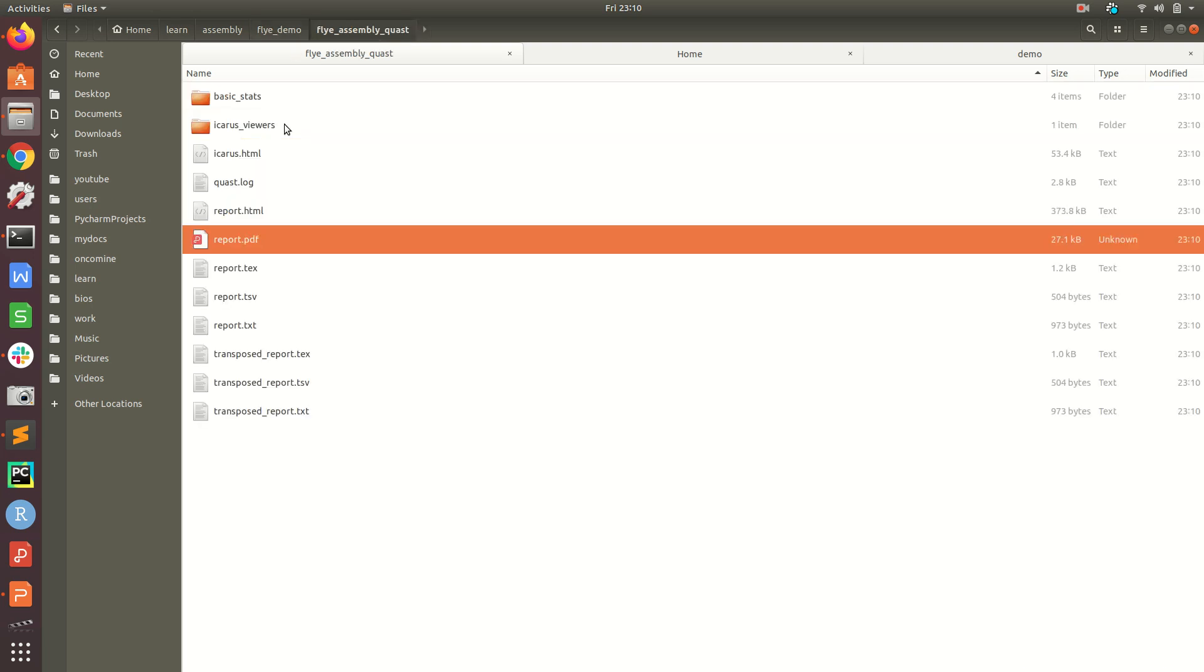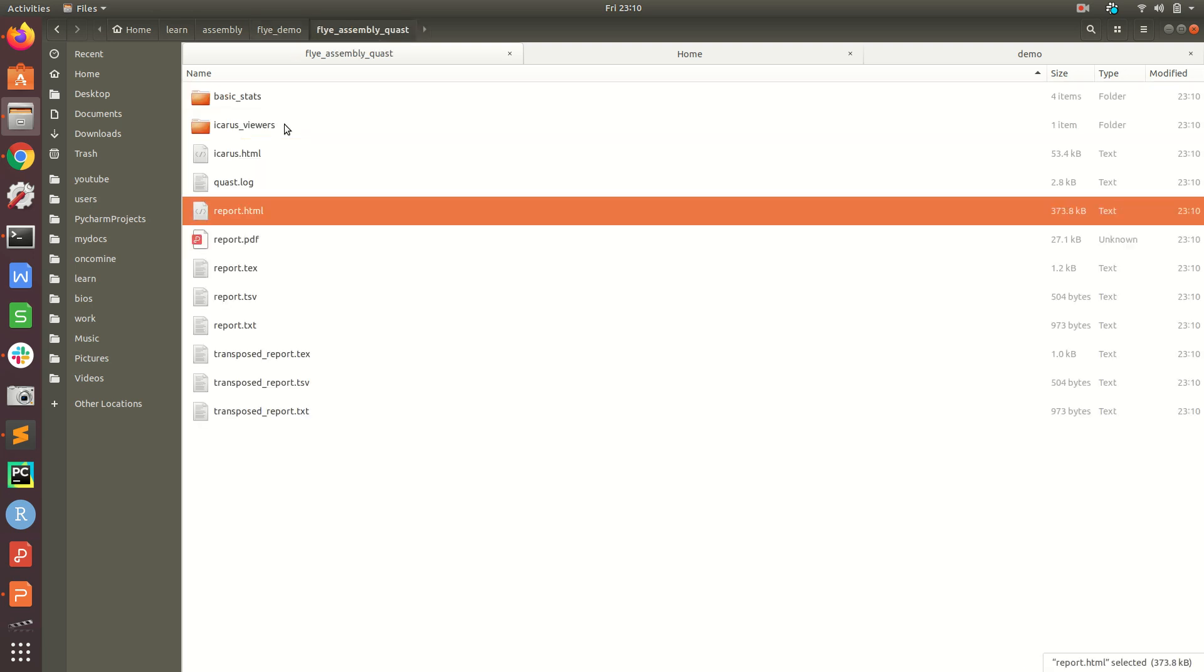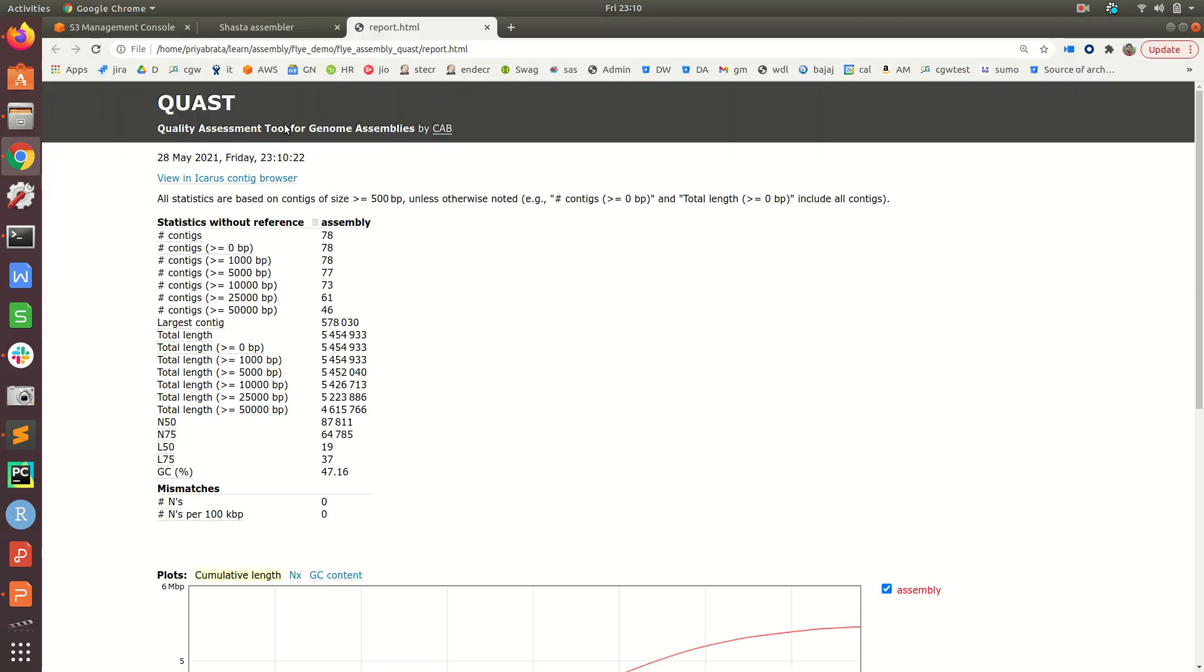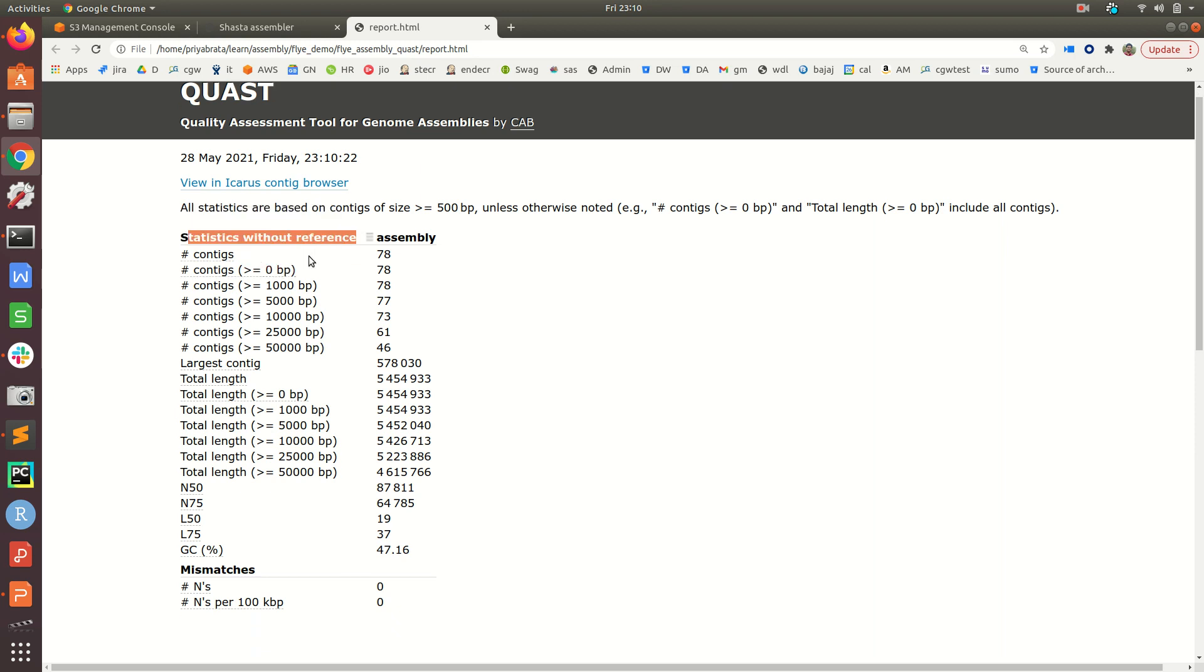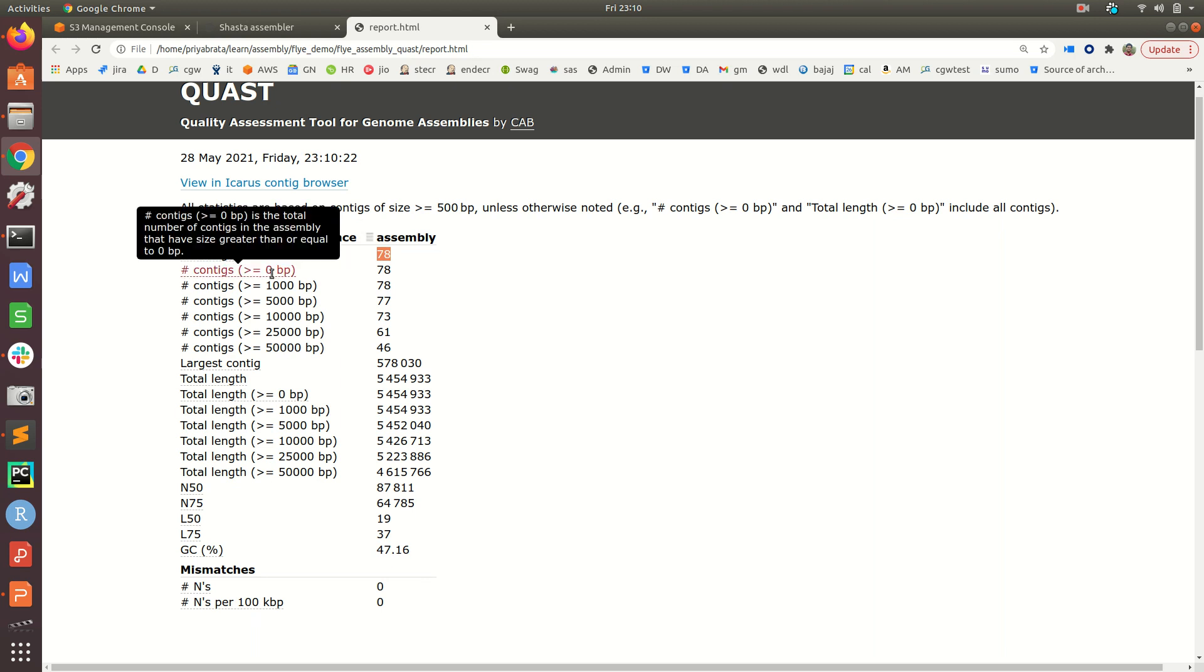Now we will go to the output folder, flye_assembly_quast folder, and let's open the report.html file. Since we are not using a reference sequence, all the statistics are without reference.